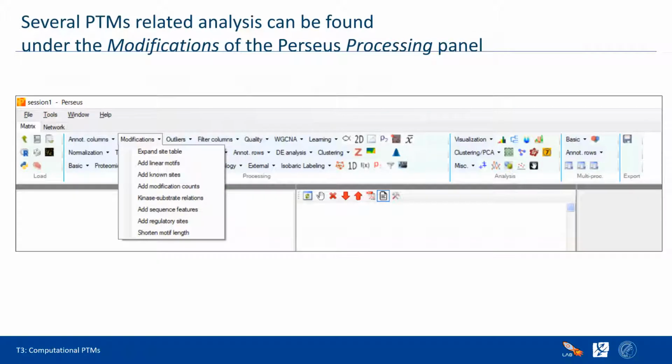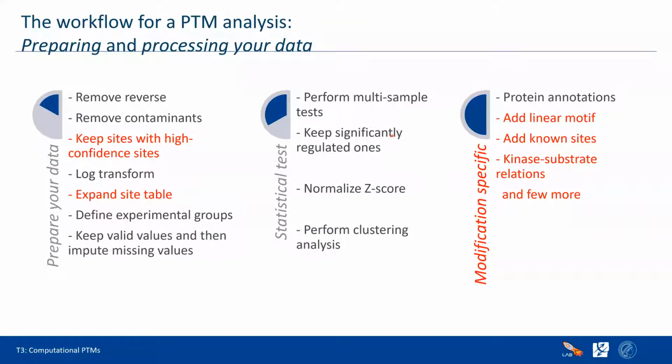And for your phospho analysis, we have the modification tab. On this modification tab, we have some specific Perseus processes where you can get more information from various sources. That's where we will go through it, and the general idea is still the same.